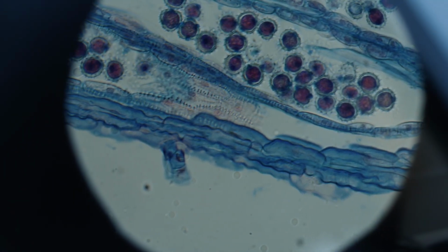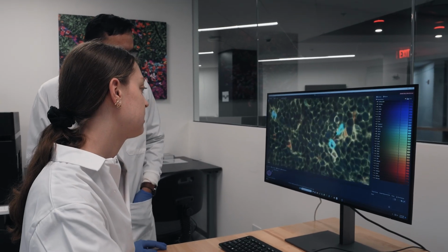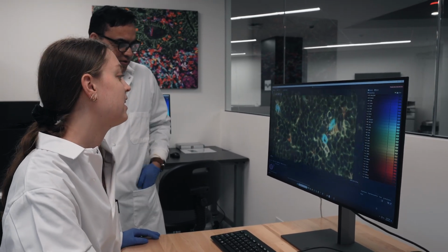Within that spatial context now, we know that we need resolution, precision, and reliability so that the image we take today and the information we get today is the same information we would get tomorrow if we took it again.